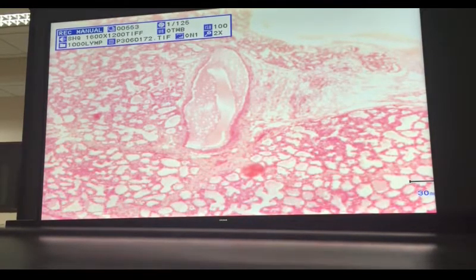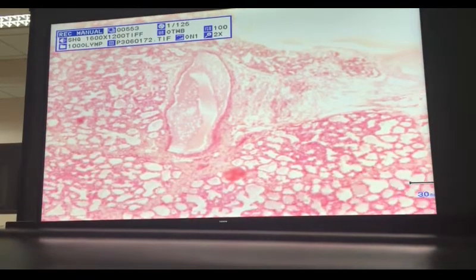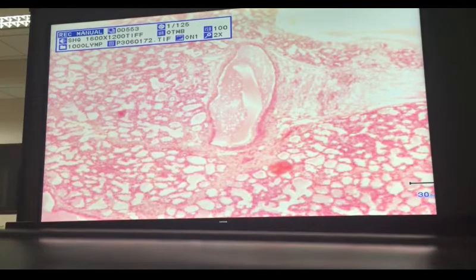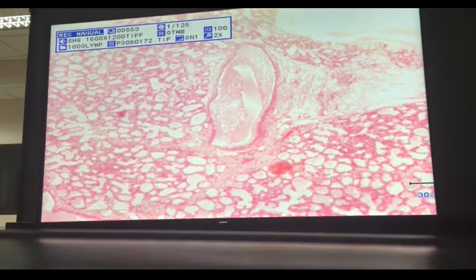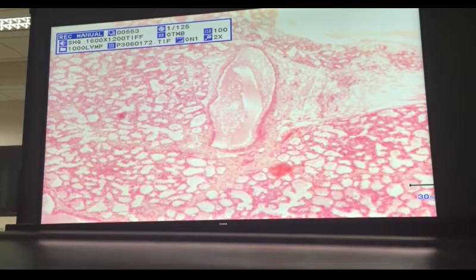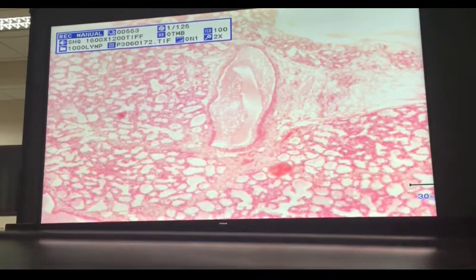So compare that to the lobule which we have previously studied. Check the pointer. On the right upper portion, that was the acini at the lobule that we have studied a while ago. Okay, and then the interlobular duct, and then look at the remaining, the other lobules, the ones that are pointed right now.